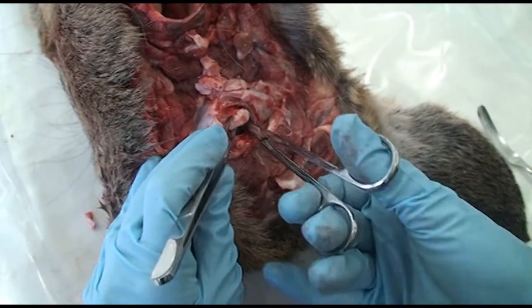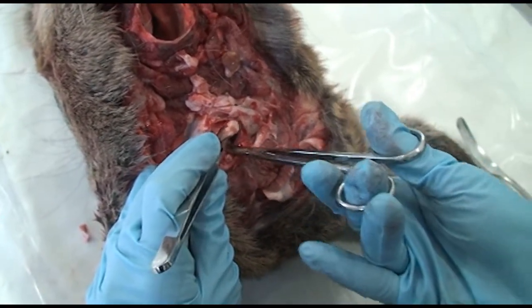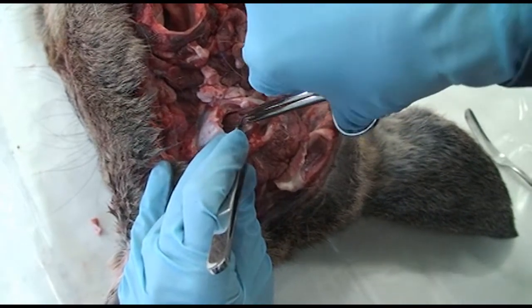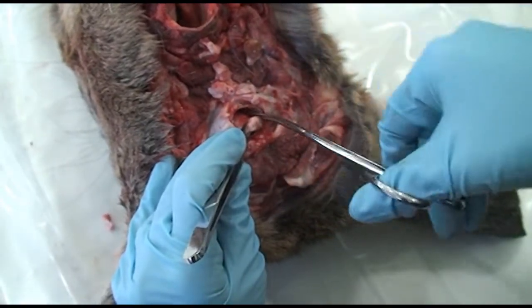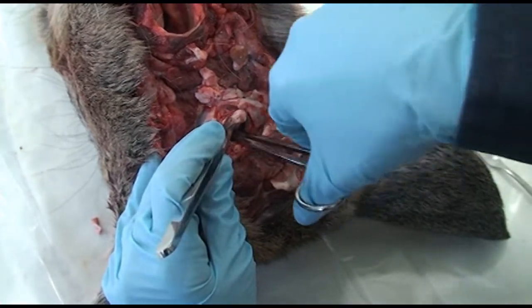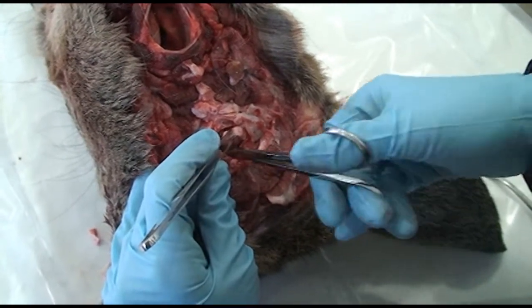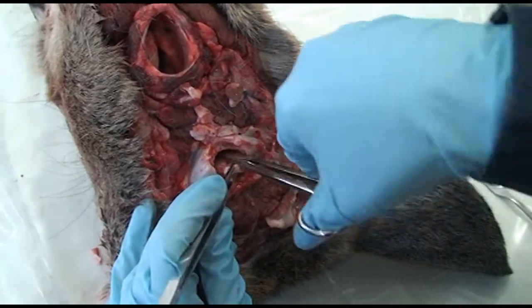And there's other connective tissue also that connects this bottom part to the cerebellum underneath it, and you need to remove all those connections, and you can kind of feel it give and release a little bit as you poke your scissors in and remove those connective tissue attachments. So you want to make sure you can go all the way around without any resistance, because some of those are in there a little bit deeper. Like, just felt another one in there. You can kind of feel those give way.